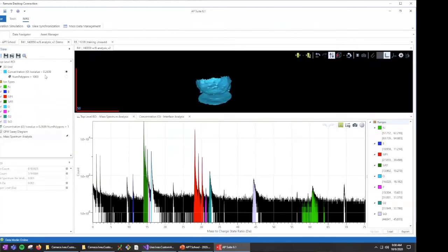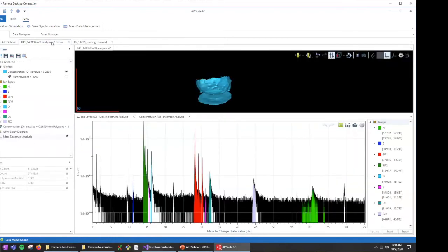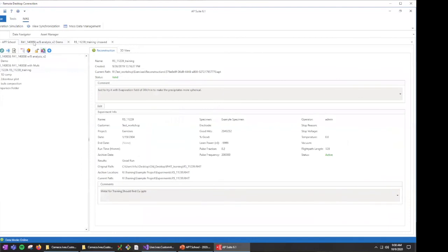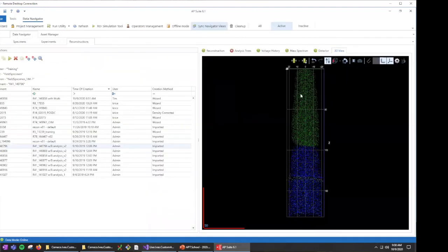So some of those reconstructions are pretty funky looking. Is that using standard, is it using sort of a Brian Geiser type protocol, or have you already put in some funky new models? These are all straight spherical reconstructions, I believe. So they're spherical voltage-based reconstructions where somebody hasn't spent any time trying to adjust the parameters to optimize things.